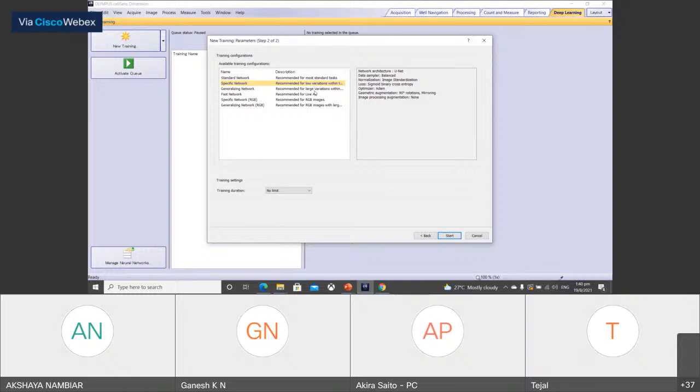And there are 3 levels of the neural network, depending on whether you have lots of variation of the objects or not. But first of all, you can try with the standard network.